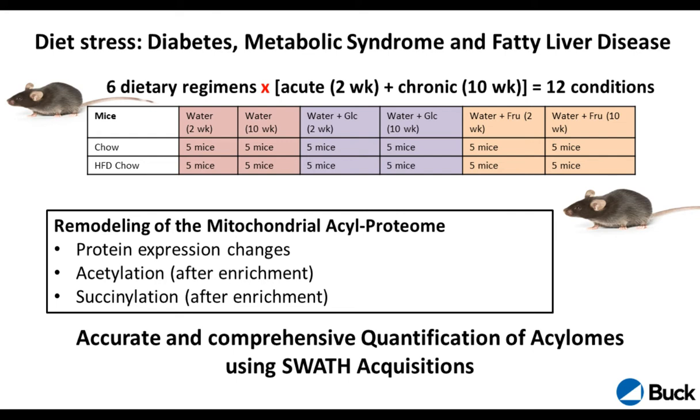Basically we were having different acetylation feeding regimens. Let's go to the next slide. And so basically we were feeding these mice, and we were looking at the acetylome, the succinylome, and also at the protein expression changes.